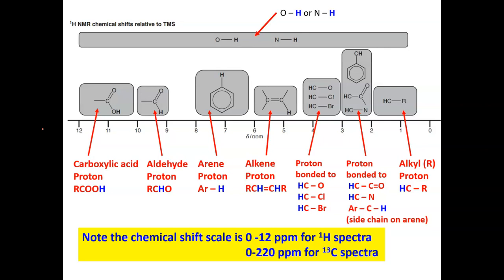Well, there is something we can do about that. We can make these disappear. More about that later on. But as you can see, the OH or NH peaks will be quite obvious. They're only ever single. They don't ever split. And they are reasonably small and can be fairly simply represented, quite obvious when you see them. But we have a way of finding out where they are by running two spectra, which you'll see later on in this presentation. So there's your data sheet.